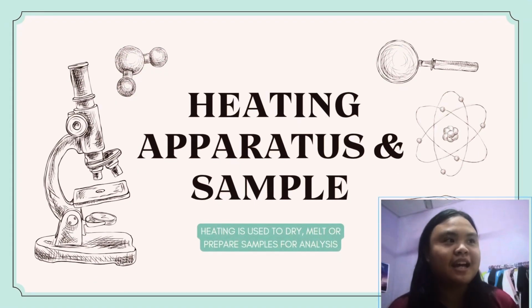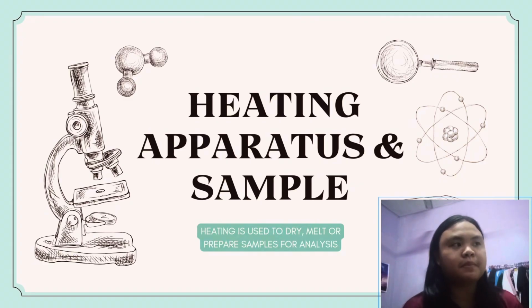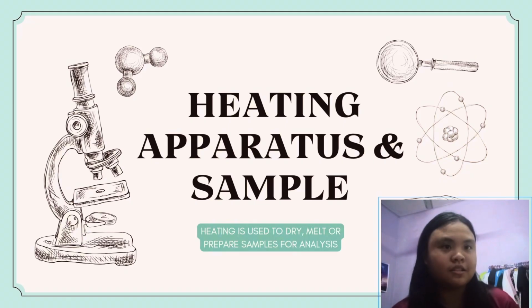Hi everyone! I will be talking about the heating apparatus we commonly use in the lab and how they help in preparing samples for testing. So, why do we need heat in the lab? Heating is essential to either dry, melt, dissolve, or prepare substances for analysis. Whether it's food, soil, or medicine, getting the sample ready properly is the key to getting accurate results.